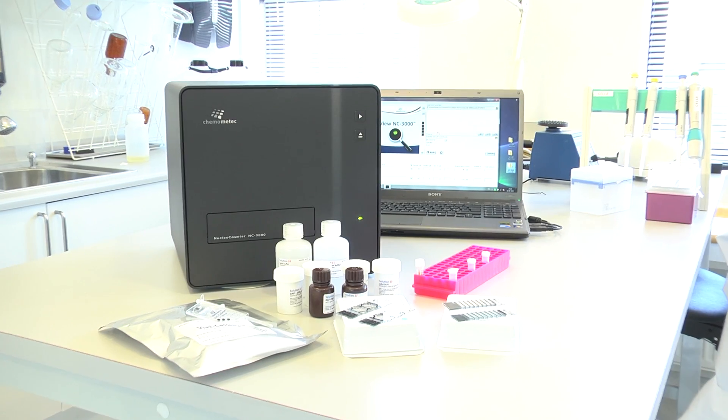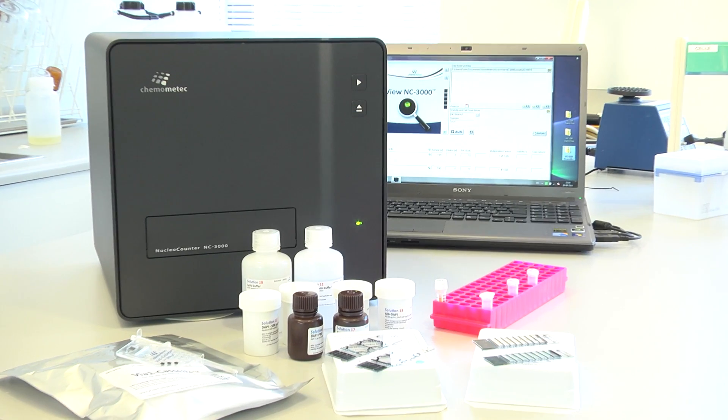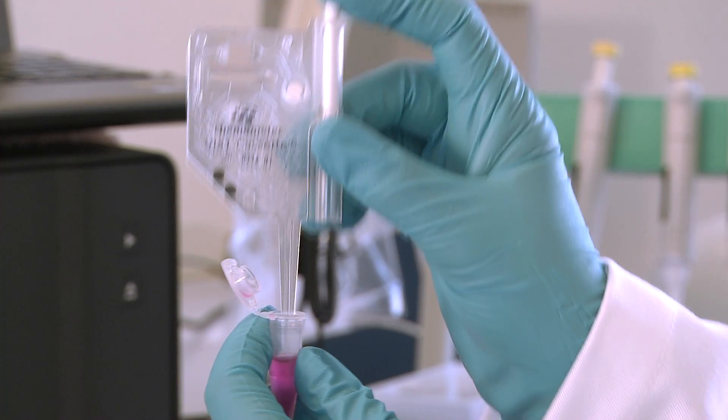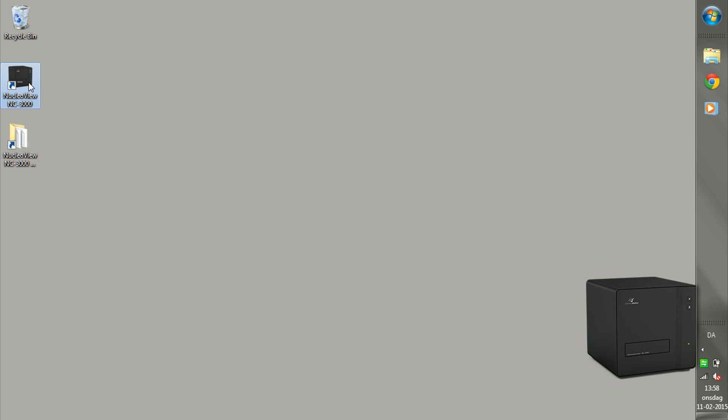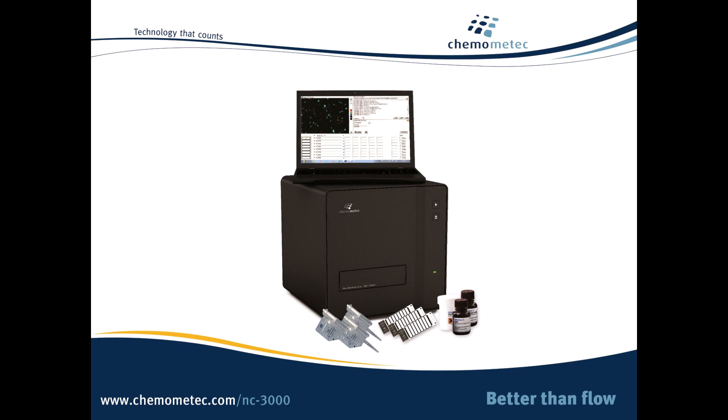If you need a powerful, flexible cytometer that offers high-speed, precise cell counting, predefined ready-to-use assays, custom assays and unlimited software licences, all with no maintenance and a footprint smaller than your centrifuge, look no further than the NucleoCounter NC-3000.